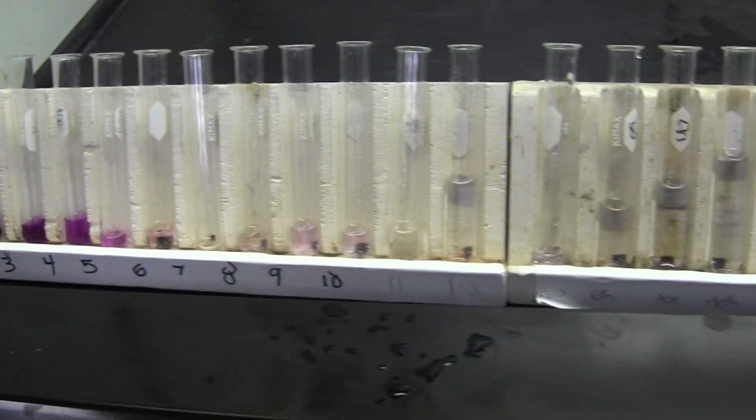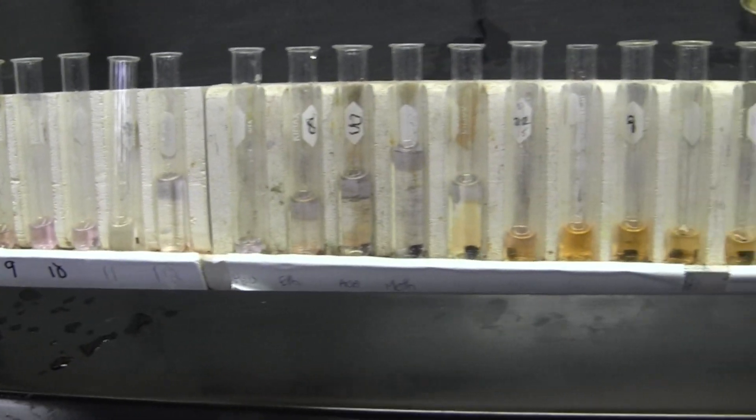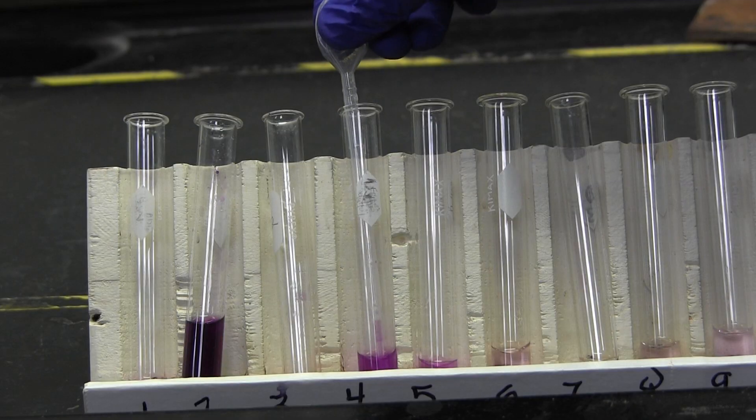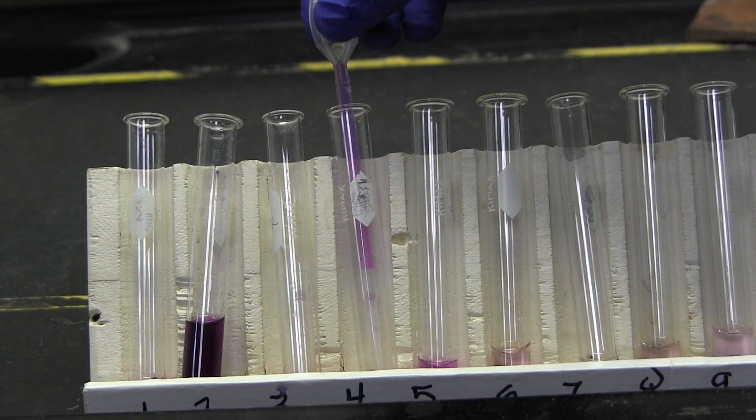Collect your fractions according to the colors eluting. Try to collect the most intense colors in their own test tubes, as these are your purest dilutants. You will want to end up with about a half test tube of each pure color.